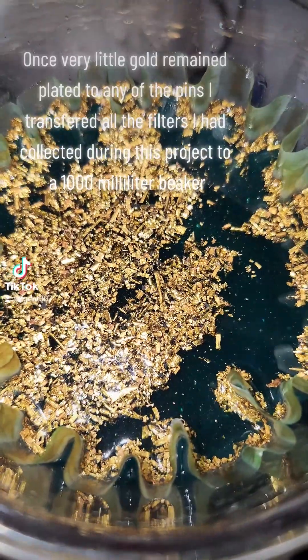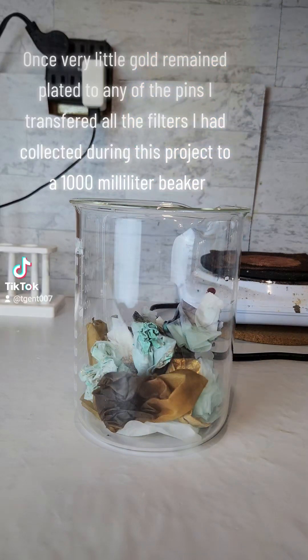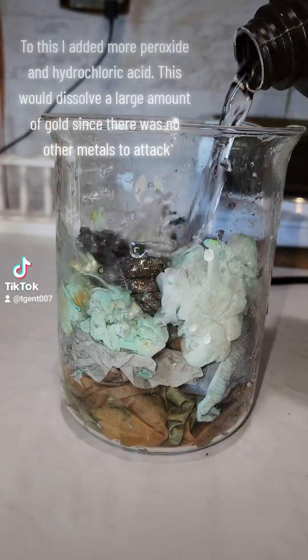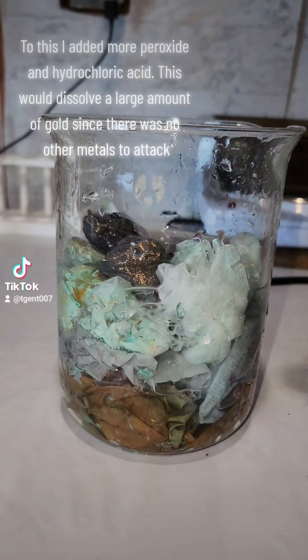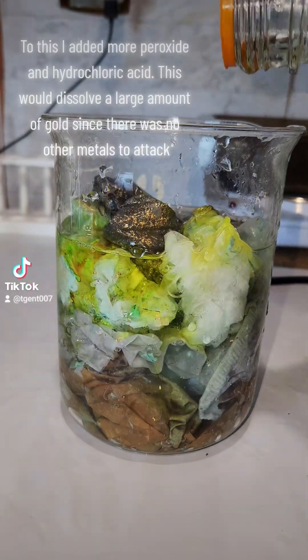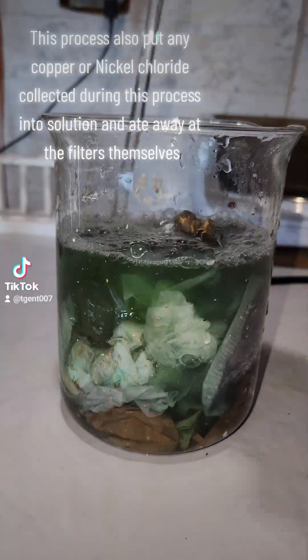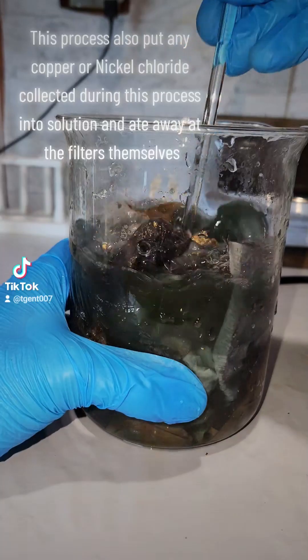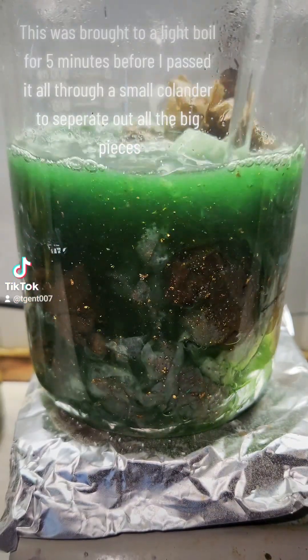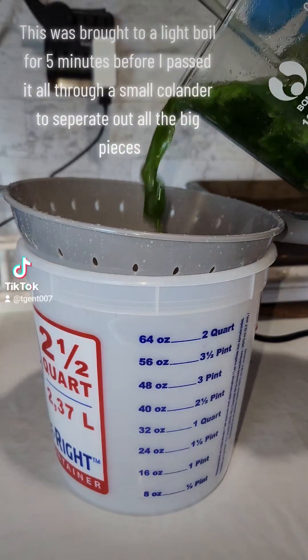Once very little gold remained plated to any of the pins, I transferred all the filters I had collected during this project to a 1000 milliliter beaker. To this, I added more peroxide and hydrochloric acid, which would dissolve a large amount of gold since there were no other metals to attack. This process also put any copper or nickel chloride into solution and ate away at the filters themselves. This was brought to a light boil for 5 minutes before I passed it all through a small colander to separate out all the big pieces.